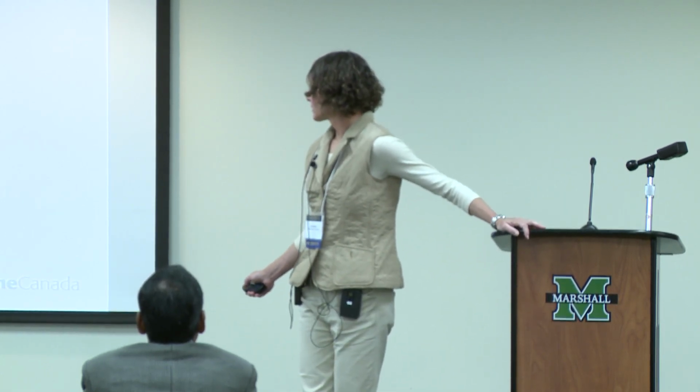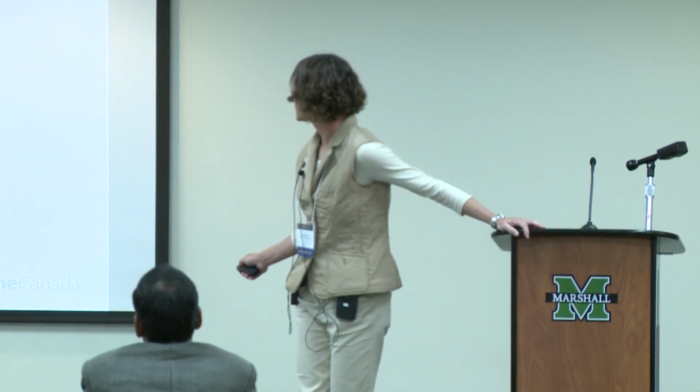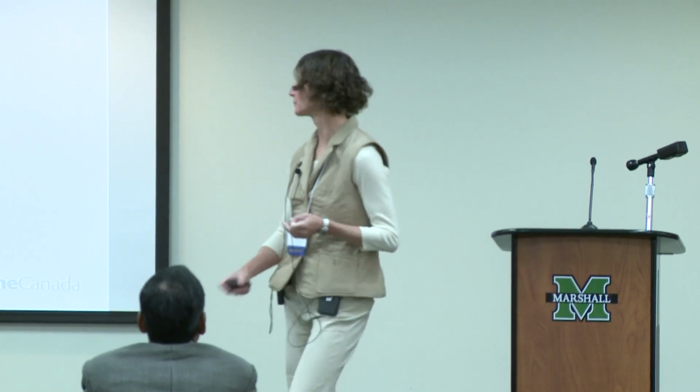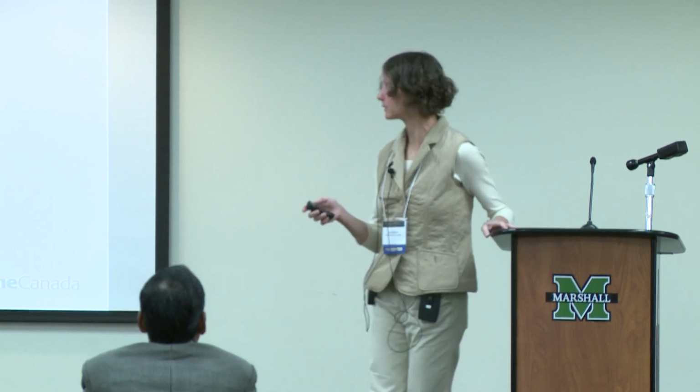The informatics on this project are going to be done at Cornell University. This is Templeton, the type specimen for the bison genome. This sequencing is going to be done at the University of Iowa. But Jim wants to sequence an animal from a different herd at Yellowstone, possibly two Canadian animals, and he has a hide from the 1850s he'd also like to sequence. We don't know which one we're going to get, but we at Marshall are going to sequence one of those genomes. We thought that would be an exciting project to build an undergraduate course out of, and start getting some students' hands dirty in actually dealing with analysis of genome sequences.